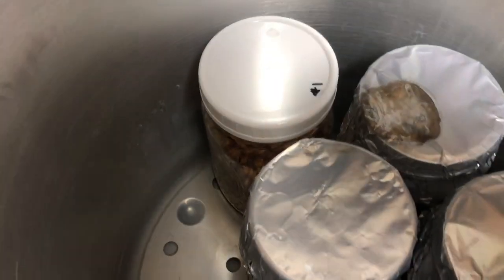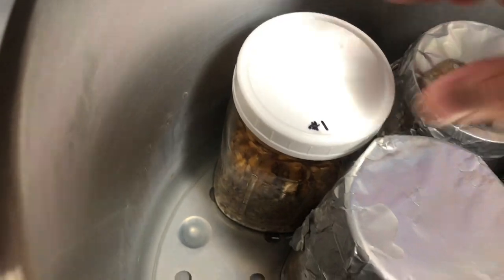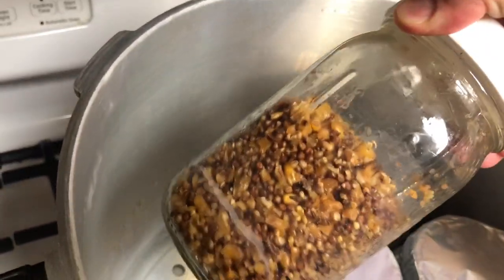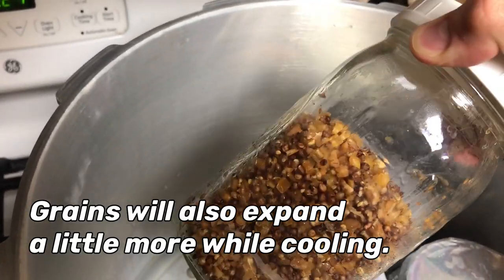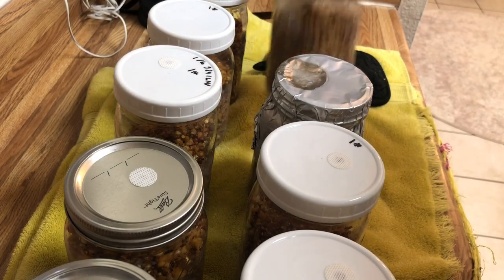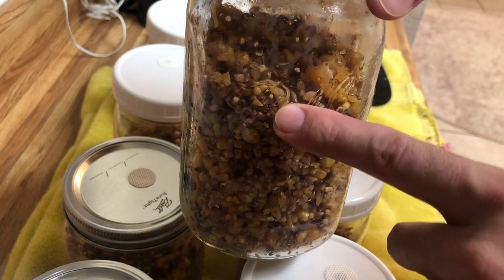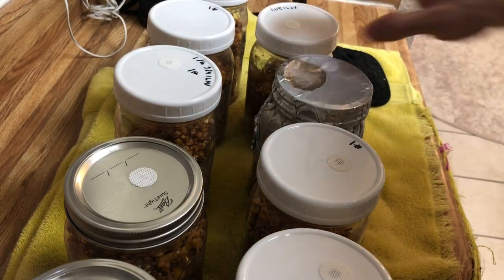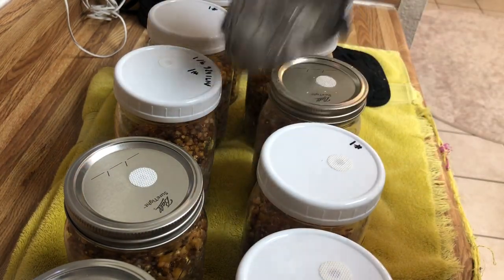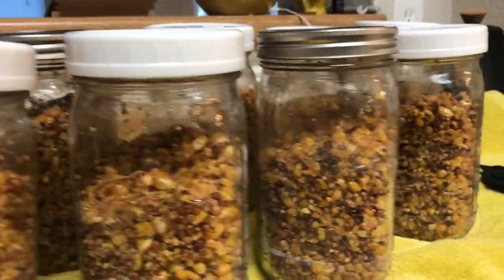Okay, so you'll see this one jar has no tinfoil on it. This is the unmodified lid, but it perfectly looks great. So what I do is I tighten the lid and then I shake it. Tighten the lid, then I shake it, then I loosen the lid just a hair again to let gas exchange occur. So you'll notice on most of these, like this jar was half full, it's only grown a little less than half an inch. But as they cool, the grains will expand a little more. So that's why we leave room. So some of these will end up having about 1/4 inch more than what they have in them right now. So just enough for grain to grain, right? And these were half full.